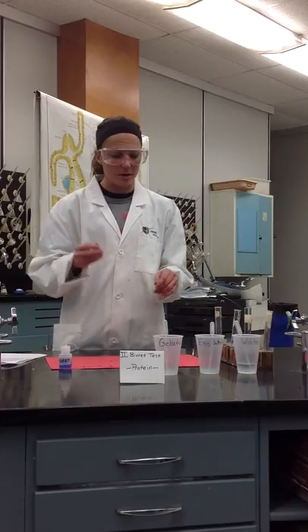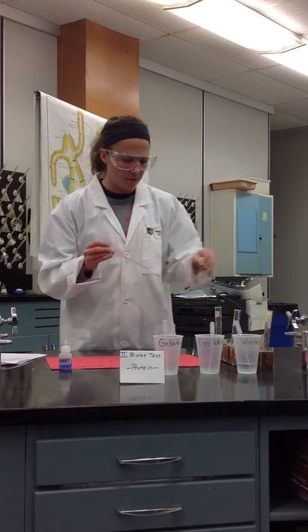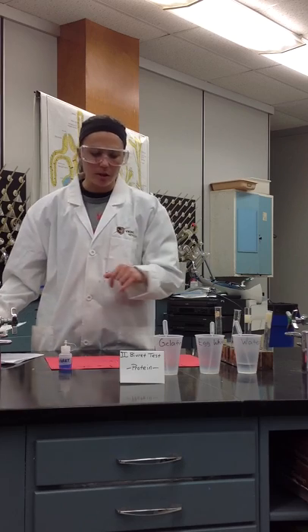Now, when you clean your test tubes, it may be necessary to use one of these stirring rods in order to get the gel substance out of the bottom. So you just will want to stir it around at the bottom. And then again, you want to use one of our major sinks here to rinse these out. Once you are done, you want to record your results on your lab report sheet and make sure you clean your test tubes.